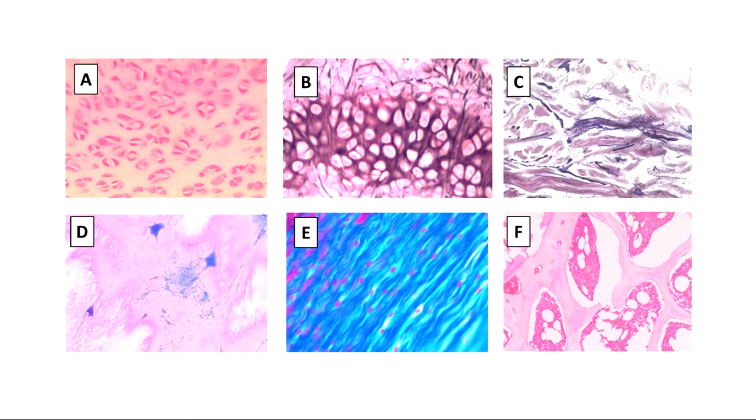A couple of us did notice that the other main tissue type that we got on here, we have some nervous tissue on here as well. Which letter is my nervous tissue? Let's start with that one because it's the odd man out. Yeah, nervous tissue is my tissue that I see here in D. D is an example of nervous tissue.